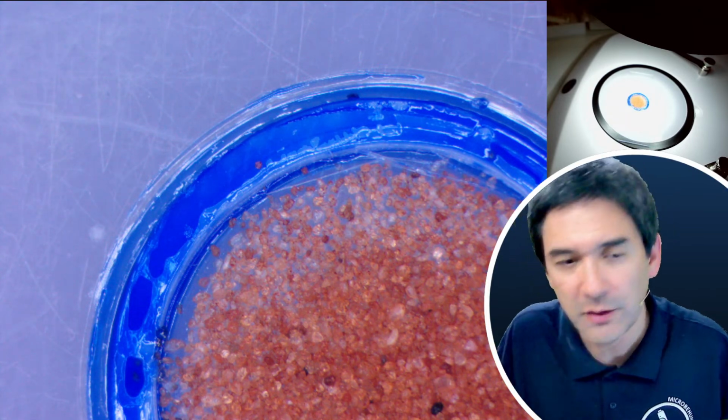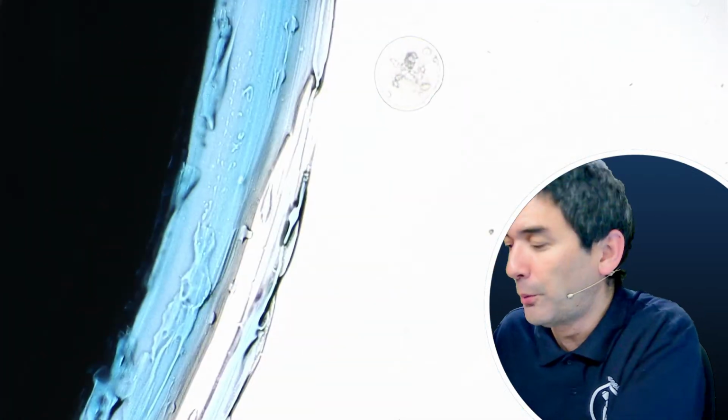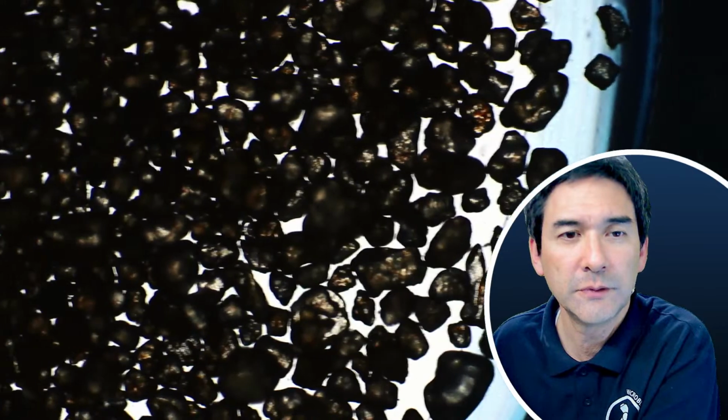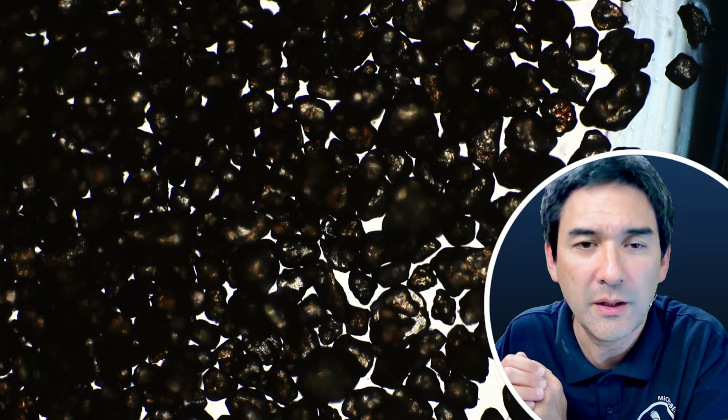So you know what? Why not try the other microscope now? Okay, so here we go. I need to switch it on. Yeah, so that's the 4x objective. The image is not quite centered. So let's do the following. Let's have a look. So this is light coming from the bottom. Okay, and you see this doesn't look quite as nice.